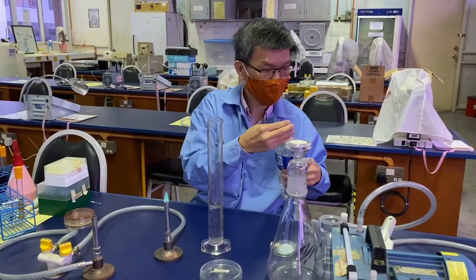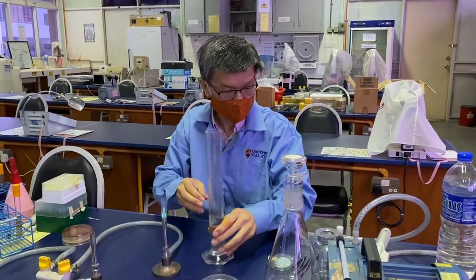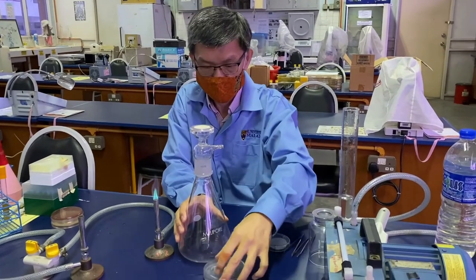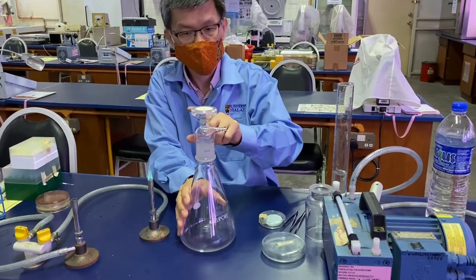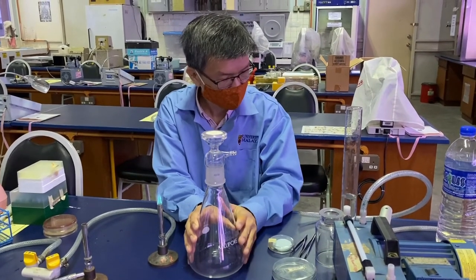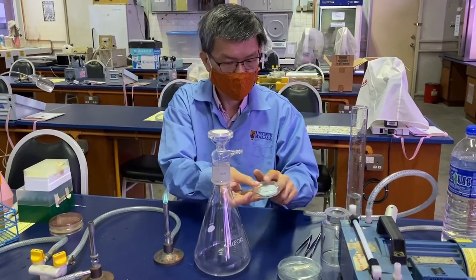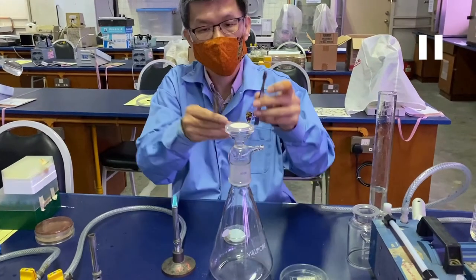After we have measured about 100 ml of sample, we can prepare the filtration set. The bottom vessel collects the filtrate, and we have a glass-based filter base on top.